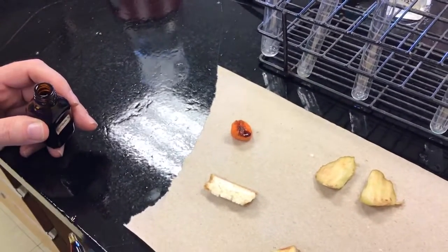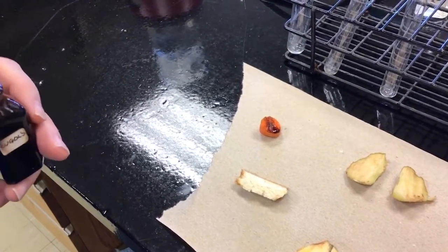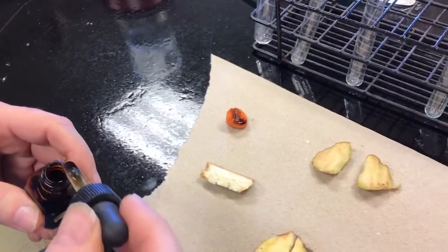I would say that you're getting black in the middle there. You can interpret it your own way. And the thing is, your yes or no just has to match your particular results. So if you don't think it turned black and you write that down and you say, no, it doesn't have starch in it, that's okay.